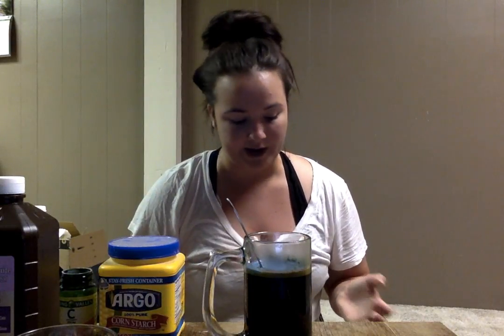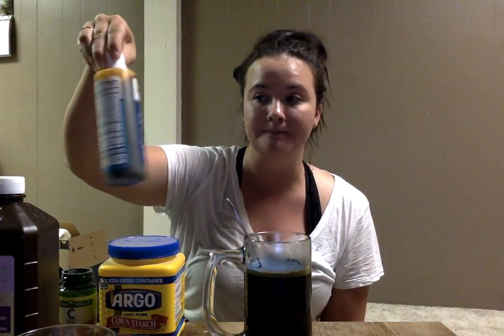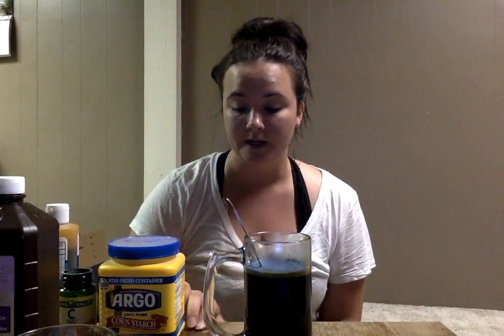Something we can talk about is what's going on. We essentially have three reactions happening. We have the I negative and I2 fighting back and forth. The I2 eventually gets used up, and what we're left with is I negative ions. And then when we pour the iodine on there, that is essentially what's happening with our color change. That is getting used up, and like clockwork, it is being dissolved.